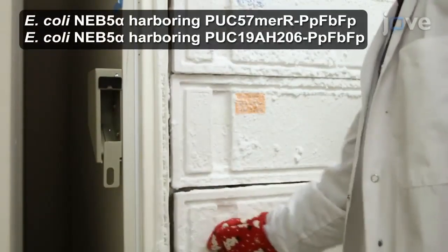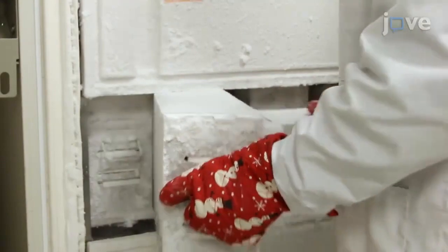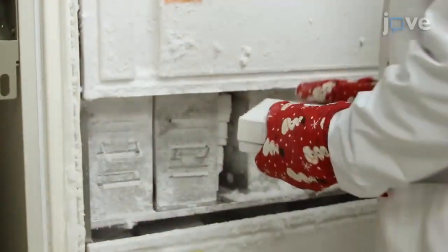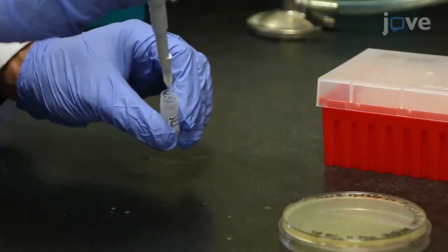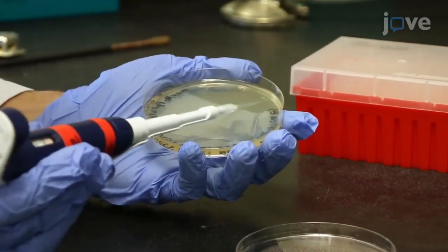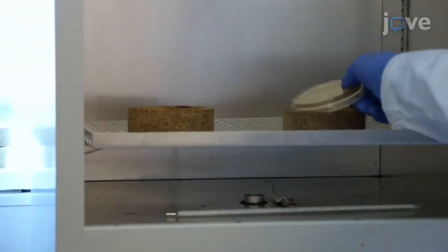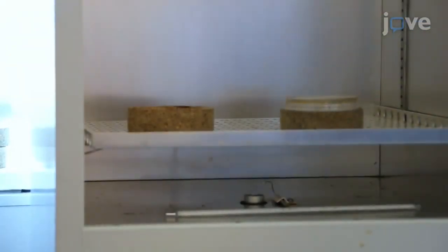To prepare for the assay, retrieve the mercury-inducible biosensor and the constitutively expressed biosensor from a minus 80 degrees Celsius cryostock. Plate the cells onto lysogeny broth plates containing 120 micrograms per milliliter of ampicillin. Grow the plate cultures in an incubator at 37 degrees Celsius overnight.